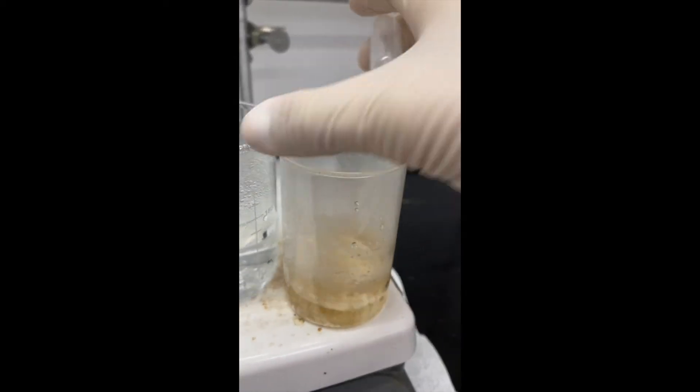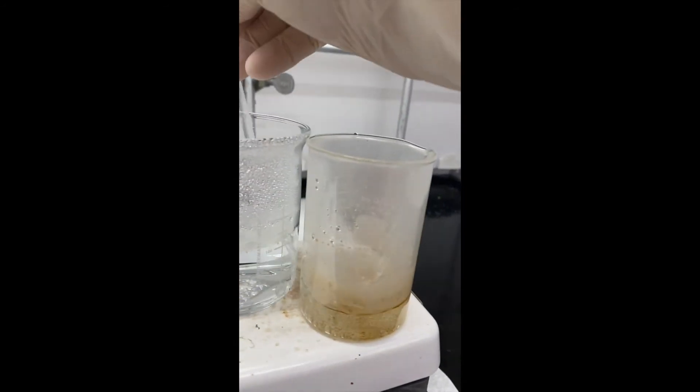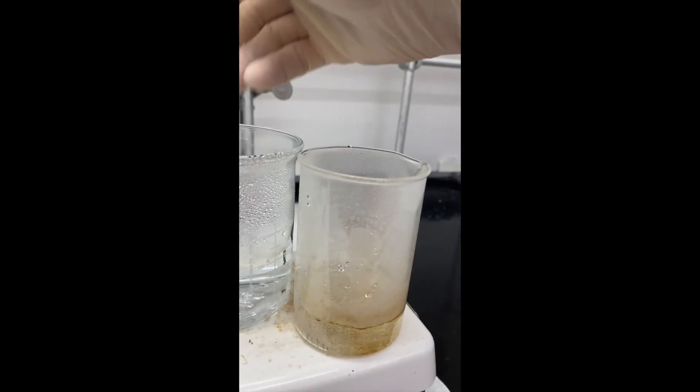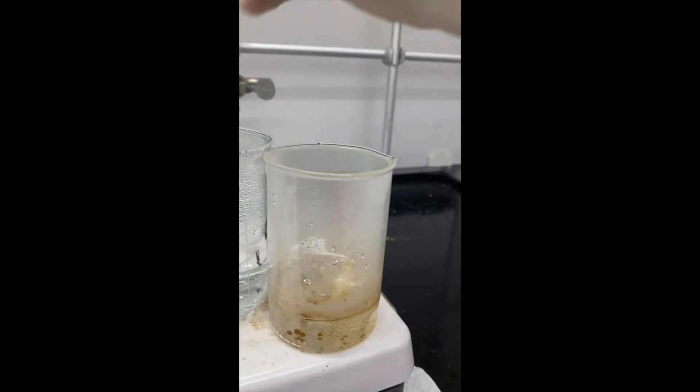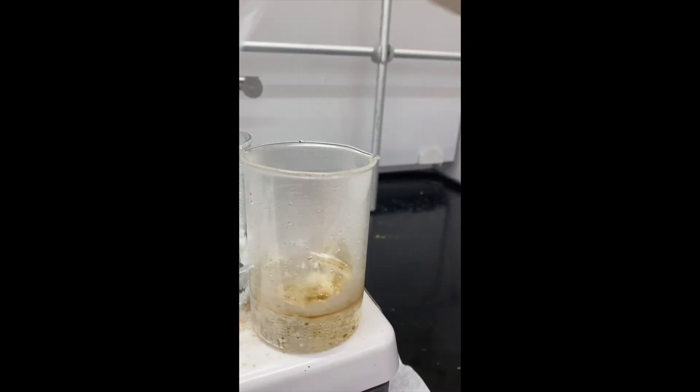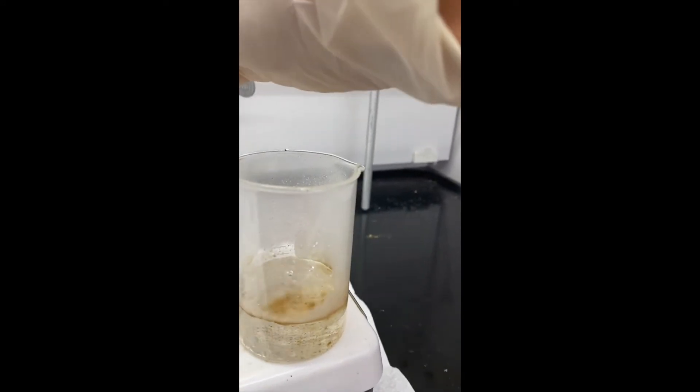So you can see we've got some discoloration in there. It actually looks like there's more than just our unknown. We've got this solid on the side here we want to dissolve. We're just using this transfer pipette to move solvent over a little bit at a time.